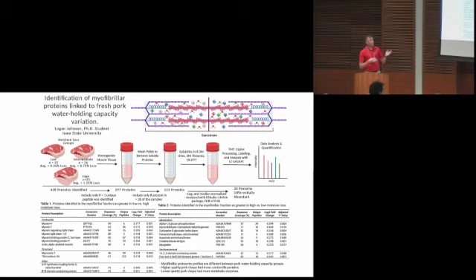We then washed to remove any unbound or non-covalently bound proteins from that insoluble fraction. We solubilized them in a urea buffer and submitted them for TMT 10-plex analysis and quantification at our protein facility on a Q-Exactive mass spec. From that analysis, we identified about 428 proteins. In this case, we're really trying to understand what is different about them. We're in discovery mode, working toward understanding future directions of research.